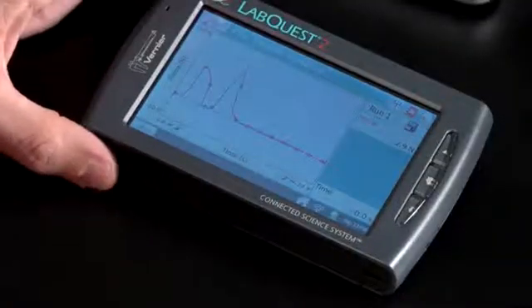And I could do the same thing on a smartphone. All I need to have is all of them on the same network. So what if you don't have a wireless network in your classroom? Or for that matter, maybe you're out in the field in Yellowstone and you want to transmit data from your LabQuest 2 to an iPad or your phone where there isn't a wireless network. Well, that's okay. You can make the LabQuest 2 its own network or create your own network.